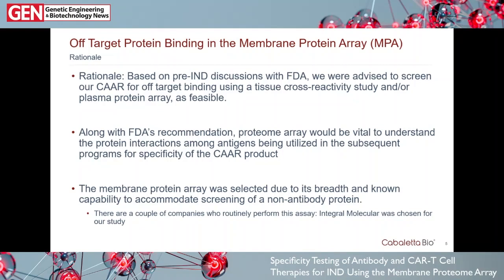Along with our thinking, during our pre-IND discussion with the FDA, they also advised us to conduct a similar screening. They wanted us to screen our CAAR T for off-target binding using either tissue cross-reactivity screens or a plasma protein array, whatever is feasible for us.